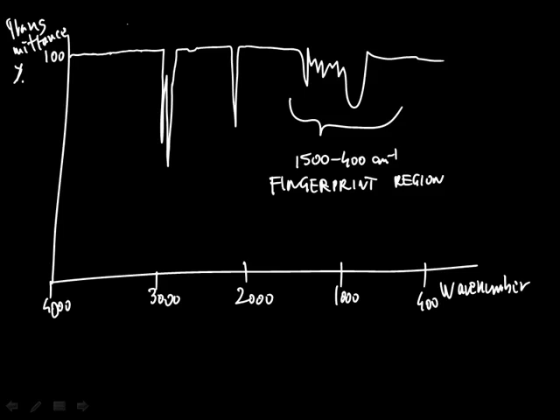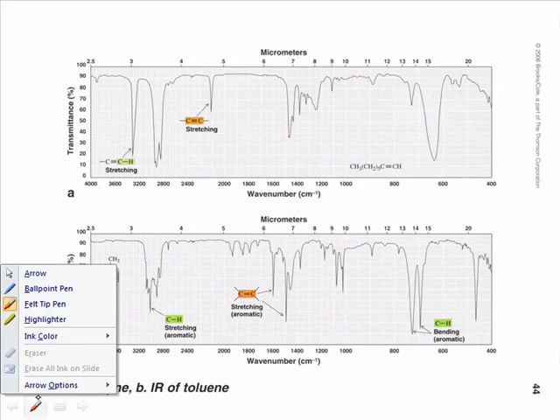Okay, but sometimes the suspects leave much more obvious clues, like leaving a business card at a crime scene. And these obvious clues are the presence of functional groups, and these are the vibrations which will allow us to quickly identify our compound. Using the fingerprint region, we could do it, but it would be much slower. Now, in the next couple of slides, we will look at some experimental IR spectra, and I will highlight the features that we've seen so far in those IR spectra. Bear in mind that those will have a white background, so it will be quite a contrast going to the next slide.